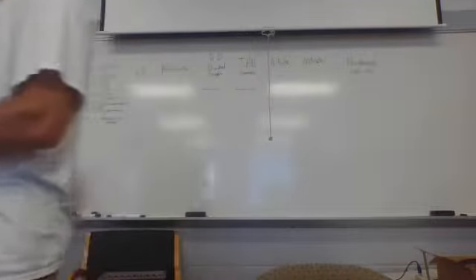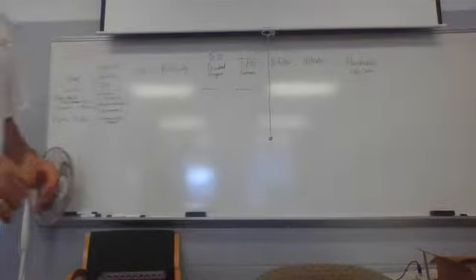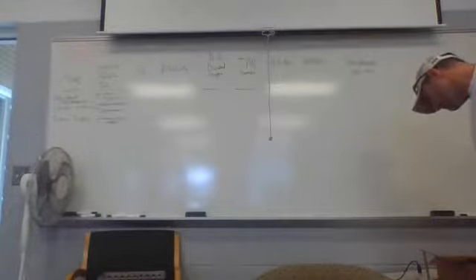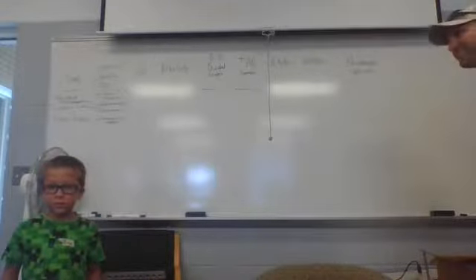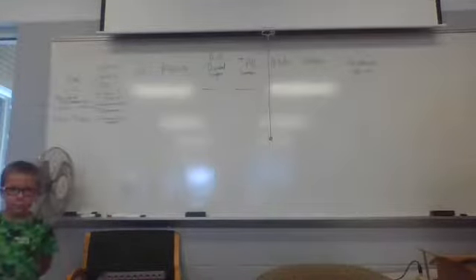One thing I want to mention about the chemical titration is that what it's testing is the chlorinity. It's a chemical test for the amount of chlorine. So it means it's only effective for seawater. You don't want to use it for any other situation. The reason it's effective for seawater is because even though salinity can vary greatly, in seawater, the proportions of those top 6 most abundant ions is the same wherever you go. So if you can test just for one of those, and chlorinity is the easiest one to test for, then you can extrapolate and calculate the overall salinity.